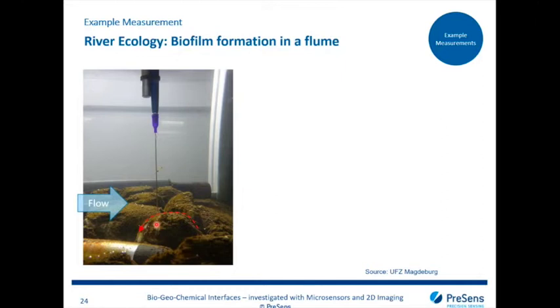The other thing that is really nice is that you can use it as well to map across heterogeneous topographies, meaning you don't need a flat surface, you don't need a transparent wall or glass to measure through. You can just measure randomly actually everywhere you would like along those stones, and therefore set your sampling design randomized or as you would like.